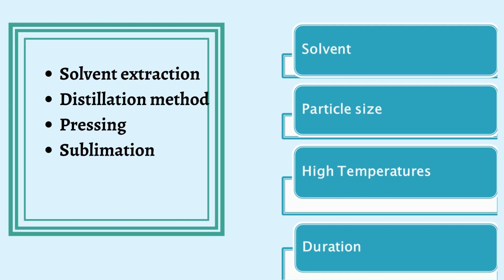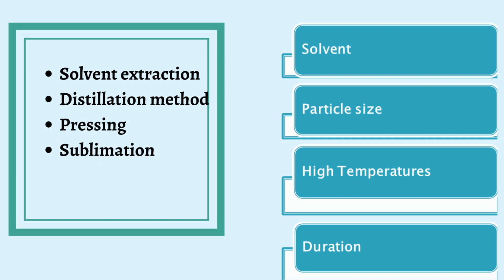Usually, solvents with polarity value near to the polarity of the active constituents are likely to perform better, and vice versa. The most commonly used solvent is alcohol, which is also known as the universal solvent, because most of the phytocompounds are soluble in a highly polar solvent like alcohol.